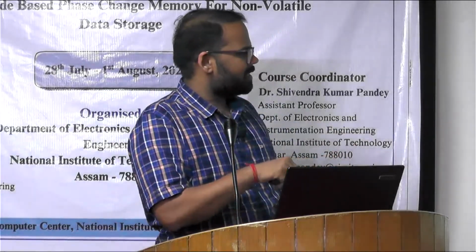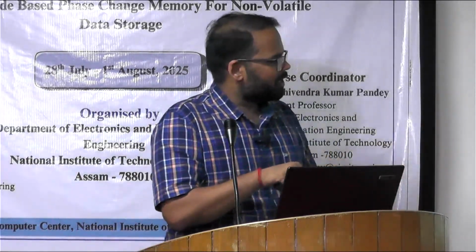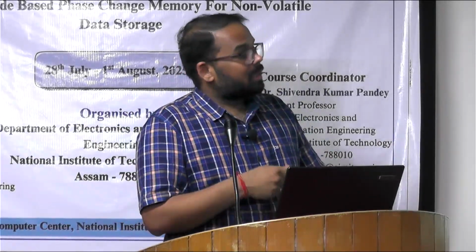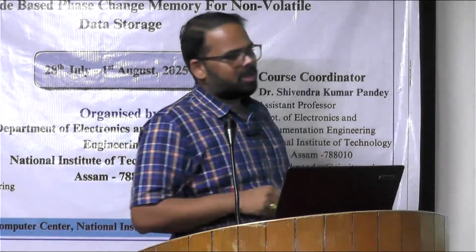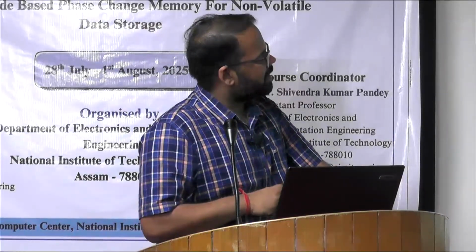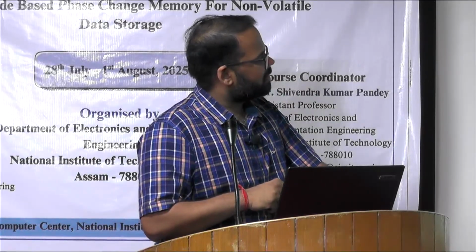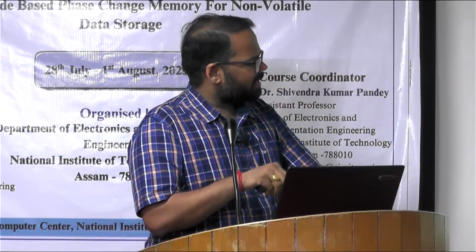This is a kind of custom built switching network and data acquisition setup which is reported in this work, where with respect to that SMU you can change the terminal and identify the resistance value. This is the pictorial view of this switching board, where a relay is connected with a transistor. It operates through this control signal, and based on the appropriate circuitry you can provide your control.